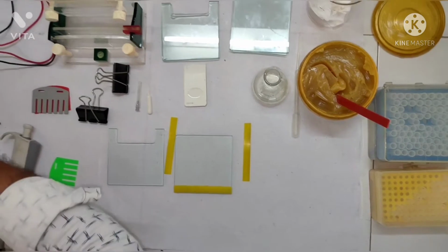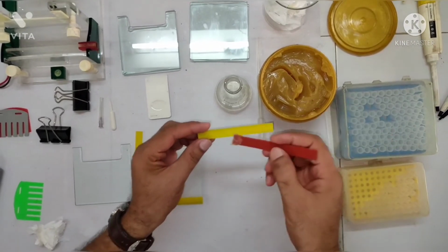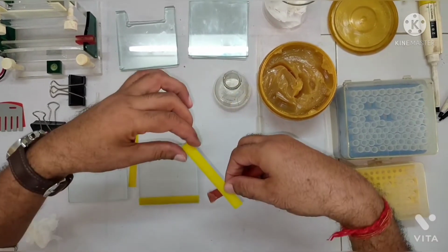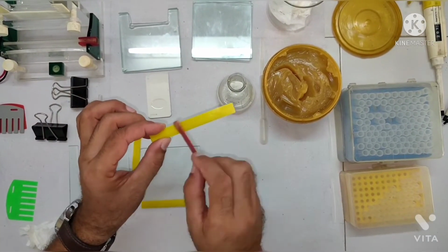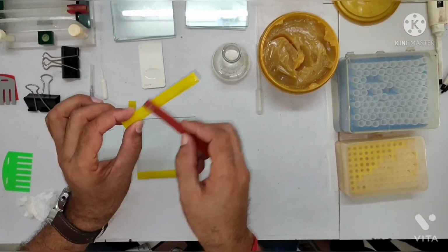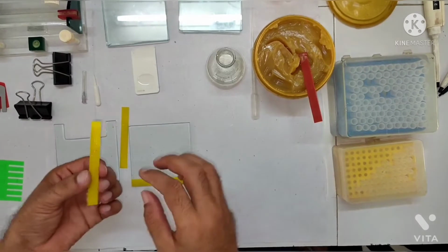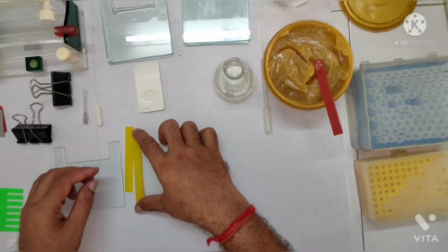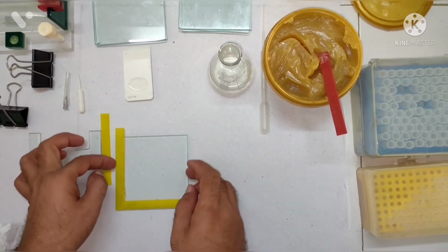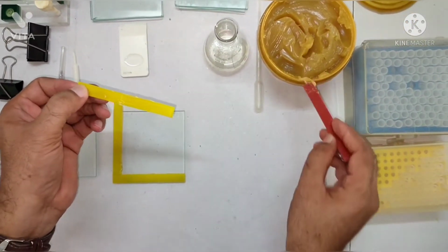Then we take another spacer, right? So another spacer, again we put, you can use Vaseline also, Vaseline is very easily available, Vaseline is nothing but the grease only, right? Otherwise you can put grease also, okay. So like this, right? So you can put this spacer at side, okay, we kept it here, and now we take third spacer. So again you put some grease over there.